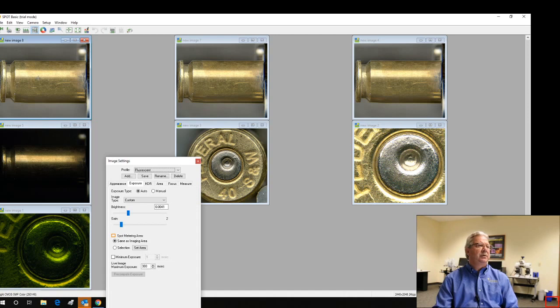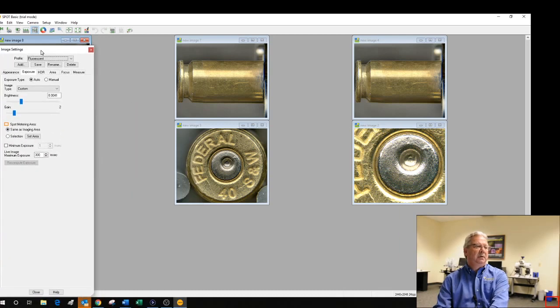Here's the newest image. So this was too dark. And when I say was too dark, let's say it was darker than I would normally set it. Here's where I would have the illumination brighter than I would normally set it. And here is what we might call a mid-range setting. And the HDR was able to equalize all of that out. Hopefully that answers your question, Laura. If not, send me another one.